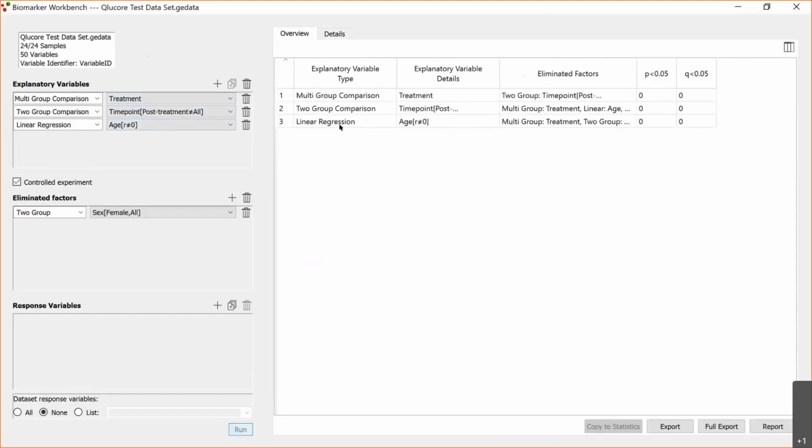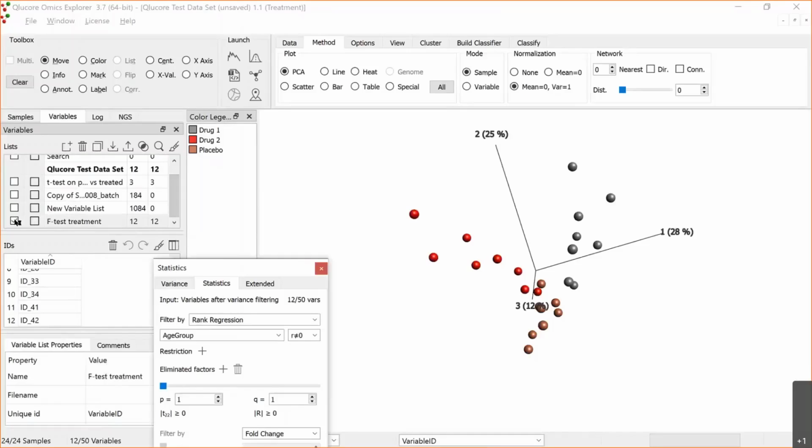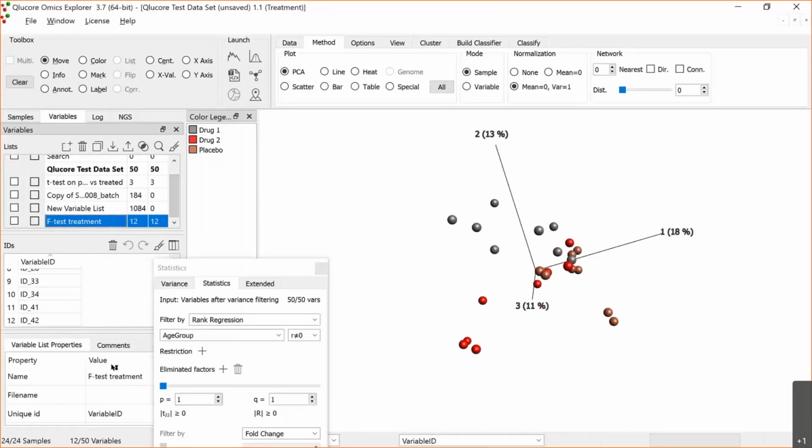okay. So this is something that you need to be aware of. When you make a list and input like this, then those are the only active variables. So when you want to continue with your test, you need to untick that box so that all your variables are active again.